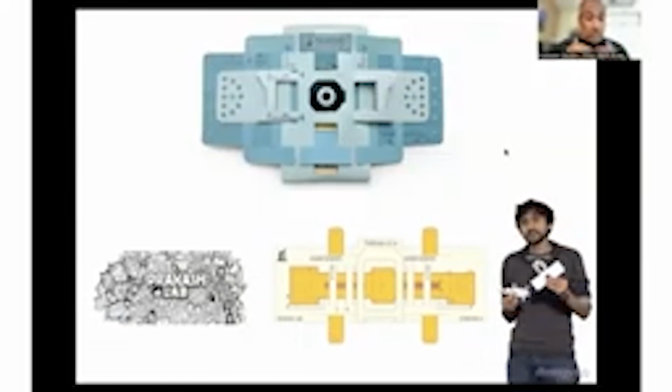And the amazing thing about this paper microscope is it gives you significantly high resolution, and you're able to see things like, for example, in a drop of water from your local pond, or even from the tap, in a way that really sparks your curiosity, right?